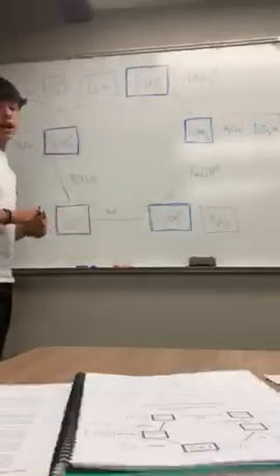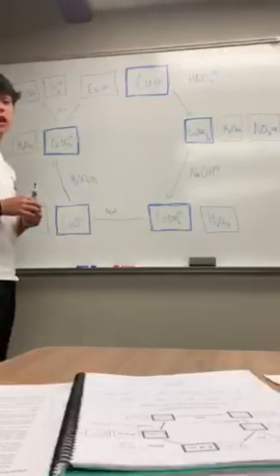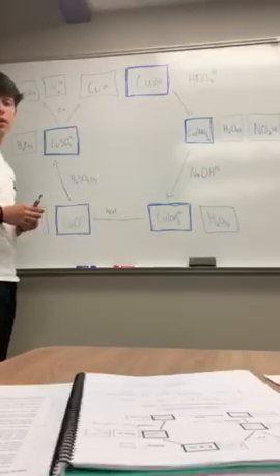Now we'll be finding how to calculate percent yield of copper.